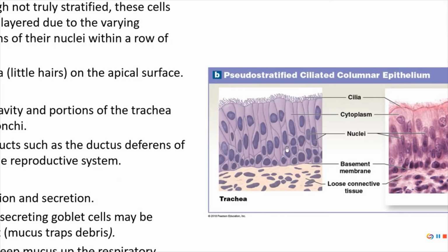Look here. Pseudostratified. See how some cells can actually touch the bottom and the top at the same time, but it is falsely stratified. It is not like one layer, another layer, another layer.